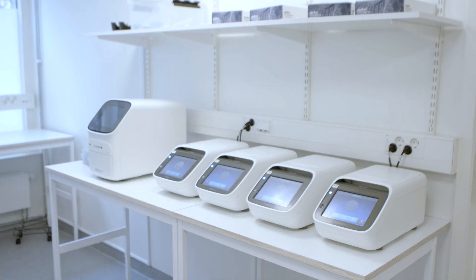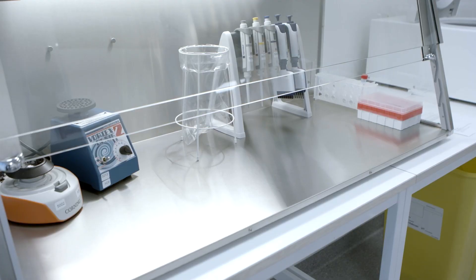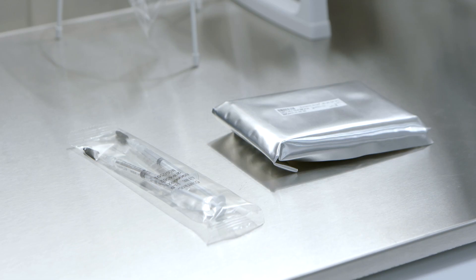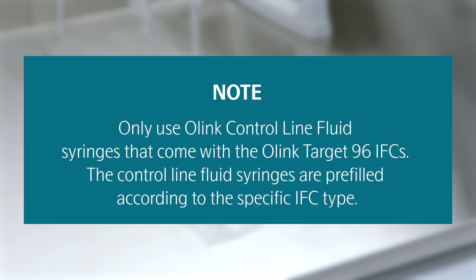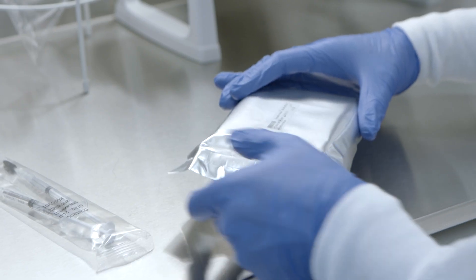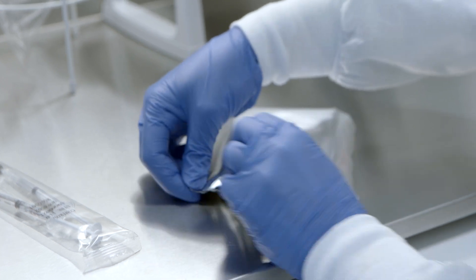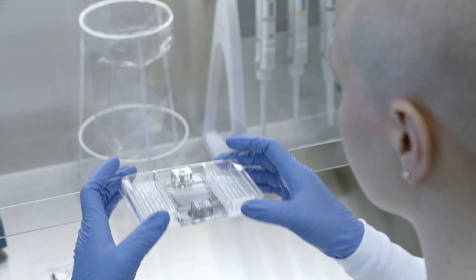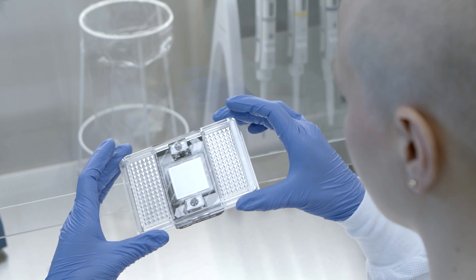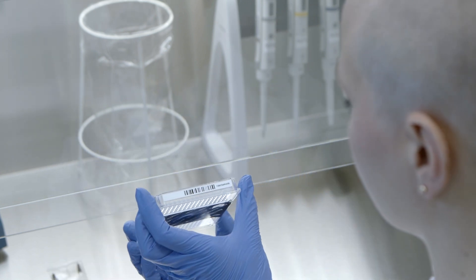The final step involves preparing samples for qPCR using O-Link Signature Q100. This begins with priming the Target 96 IFC chip. Make sure the IFC is used within 24 hours of opening its package. Only use O-Link control line fluid syringes that come with the O-Link Target 96 IFCs. The control line fluid syringes are pre-filled according to the specific IFC type. Begin by unpacking the control line fluid syringes and the IFC from the box and foil envelope. Inspect the IFC for any visible damage and ensure that the barcode label is intact and that the chip surfaces are clear of particulates before use.